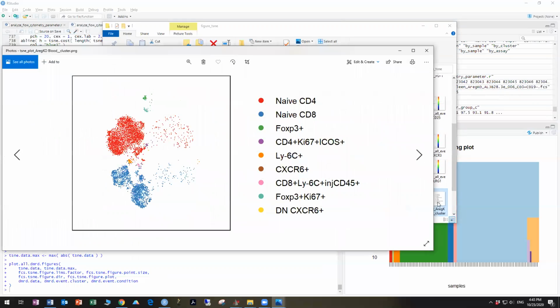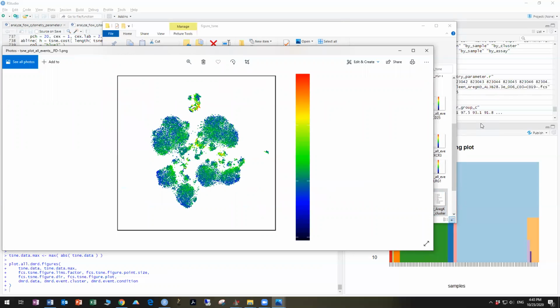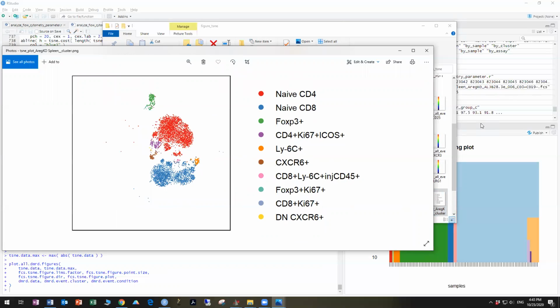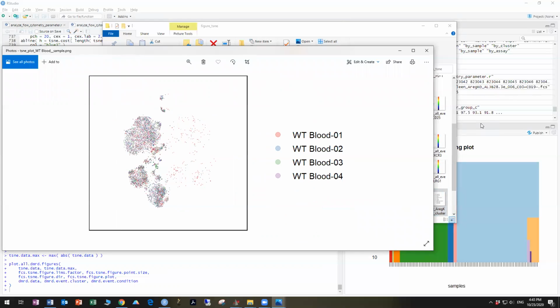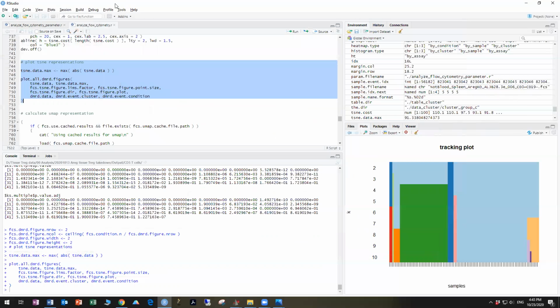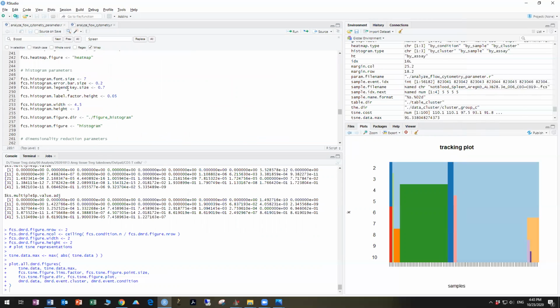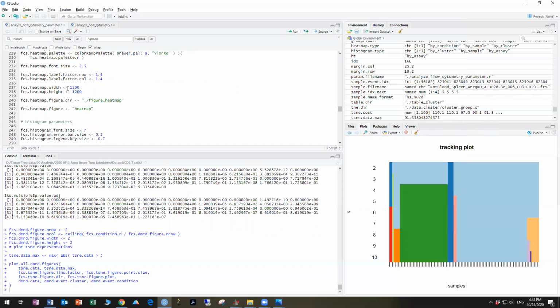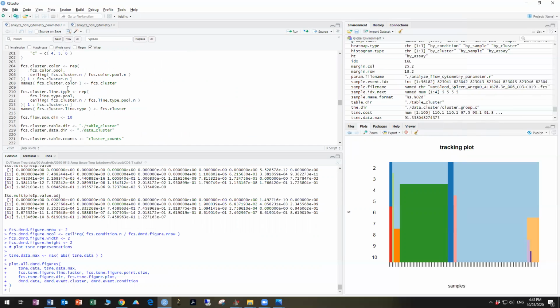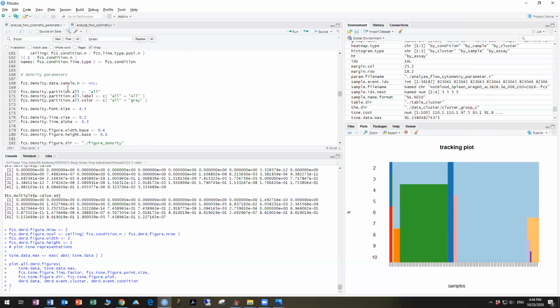All right, so that's done. So now the text is larger with respect to the plot. That may be useful to be able to change that. The other factors you can play around with if you want, but those are the main ones that I use.